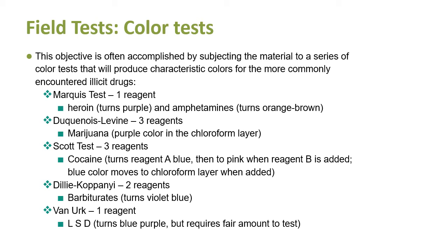I will share a video that shows an example of some of these field tests and how they're done. Essentially, they're mimicking little beakers and test tubes and reagents in these nice field-based tests that can get you some preliminary answers.